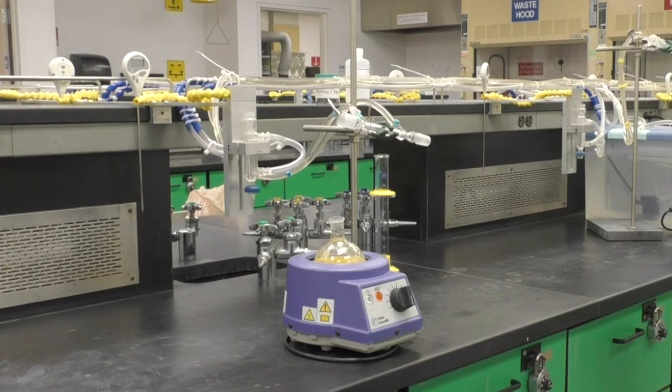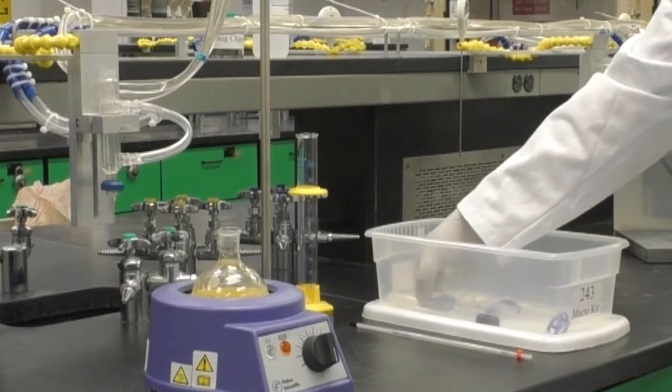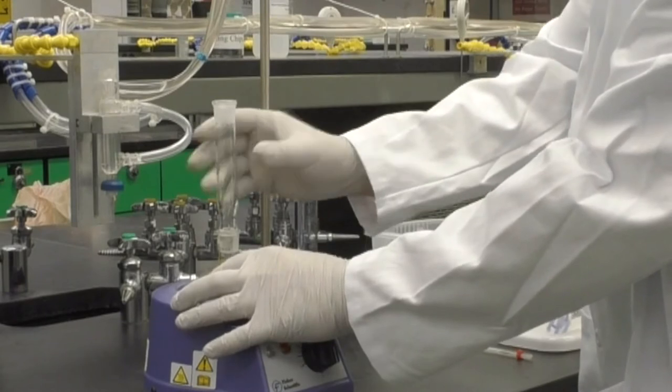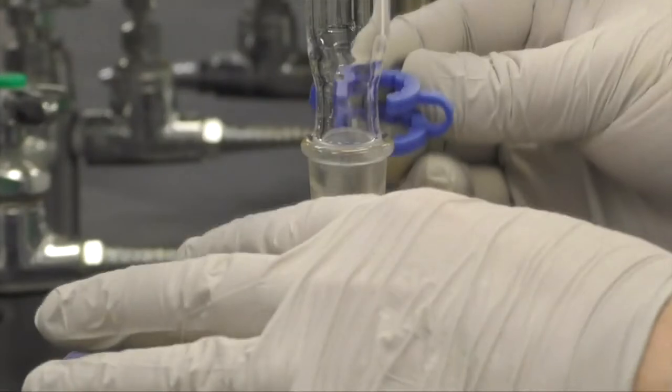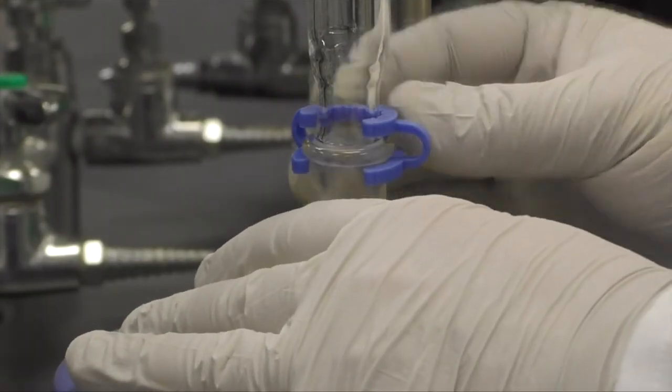You are now ready to assemble the distillation setup. The water-cooled condenser has already been set up on your bench. Place the fractionation column onto the neck of the round bottom flask. Secure it by pushing one of the Keck clips over the area where the two pieces meet.